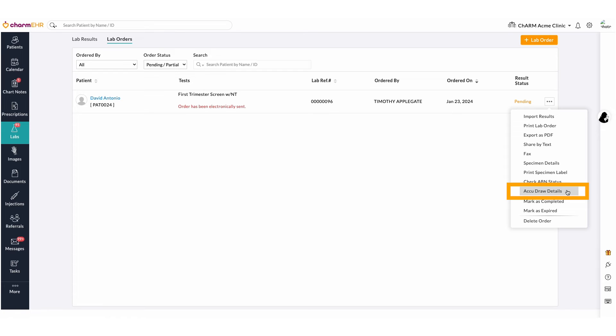The AccuDraw details option is used to know how the specimen needs to be collected. A LabCorp AccuDraw service provides the client with on-screen visual cues along with specimen collection instructions to help ensure accuracy and precision.